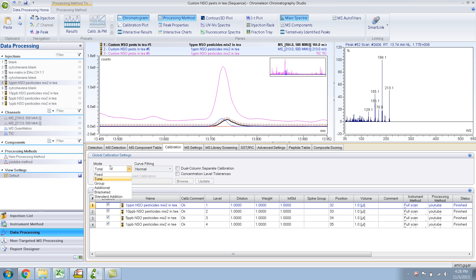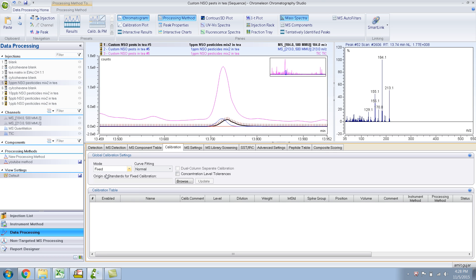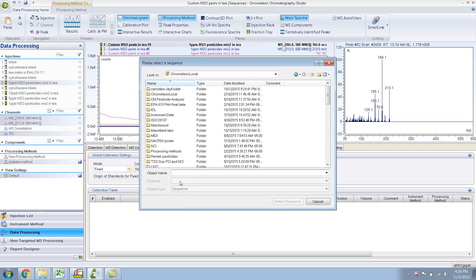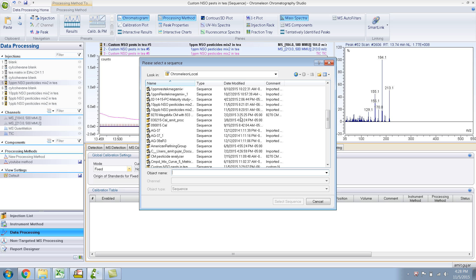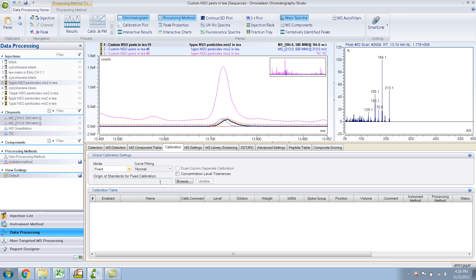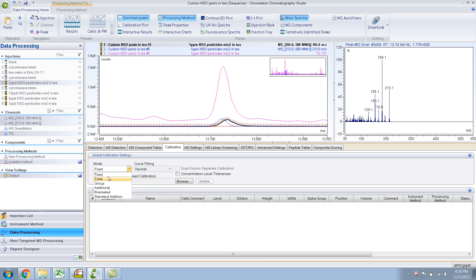The way you would do this is you would go to fixed and then go to browse and then you can choose basically a sequence where it is. Right now our calibration injections are right here in our sequence, so we don't need that. So we go back to total.